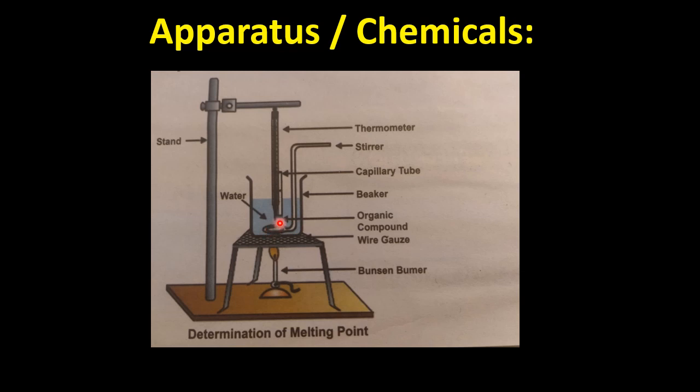Now what you have to do? You have to insert this apparatus in a beaker having water in it. The capillary tube is basically like a straw with two open sides. When you have to take a compound in it, we have to close one end by heating it. Then we take the compound in it.